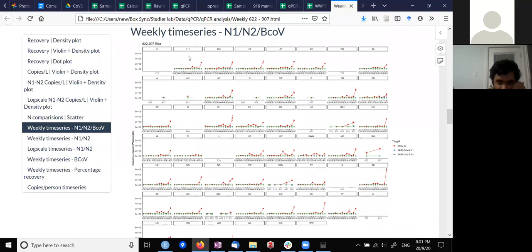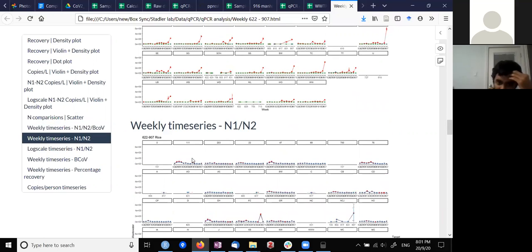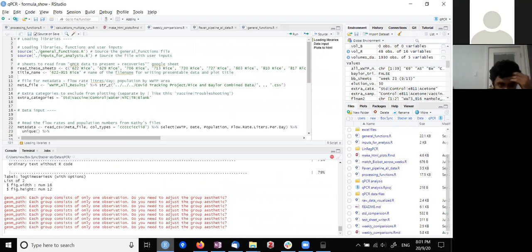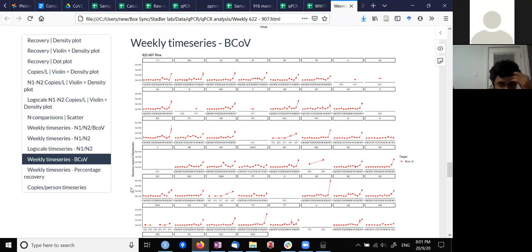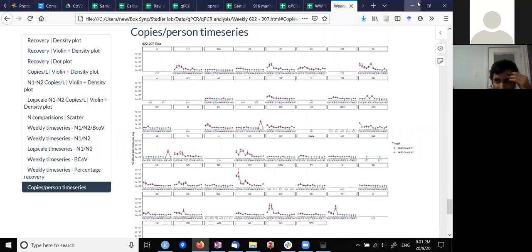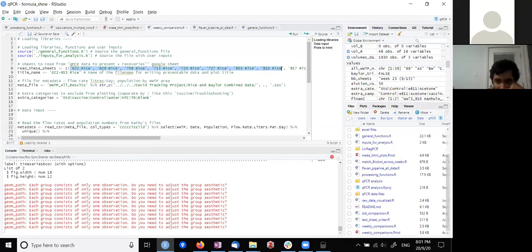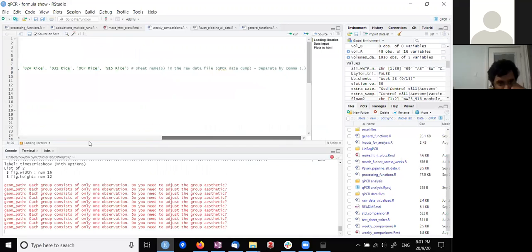Now these are very tiny plots. What they're doing is, at each treatment plant, connecting the dots for each time point. The x-axis is the time points. I used to have fewer weeks previously, but Lauren wants all of the data here, so this is what I've been doing. But I think there's no trend that's visible. So what we can do is, next time we run it, we can remove all of these old ones and just run it from mid-August through September or something like that.